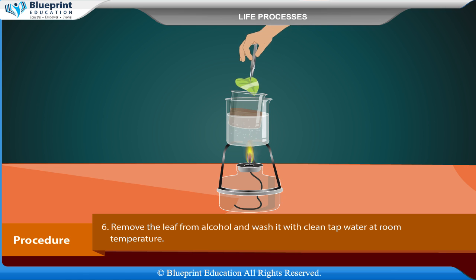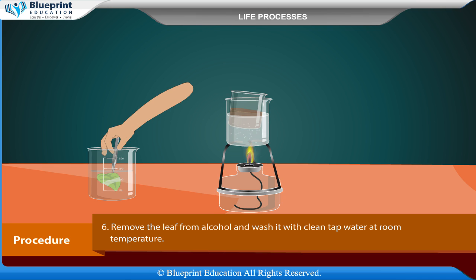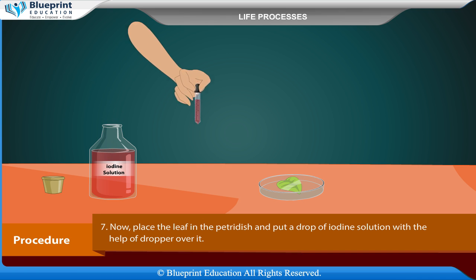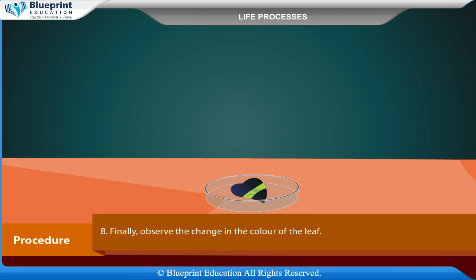Boil the leaf in a beaker containing alcohol in a water bath to decolorize the leaf. Remove the leaf from alcohol and wash it with clean tap water at room temperature. Now place the leaf in the Petri dish and put a drop of iodine solution with the help of a dropper over it. Finally, observe the change in color of the leaf.